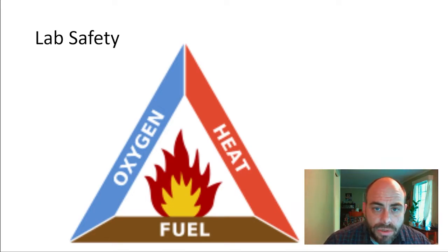There's a fire extinguisher by the door, and there's a fire blanket, of course, in the room for throwing a blanket on the fire. I've never seen one used, but I guess it's to remove the oxygen. The fuel, obviously, we just shut the gas off. There's a button in the back of the room that shuts all the gas and electricity off in the room if there's ever an emergency, and so that's fire.